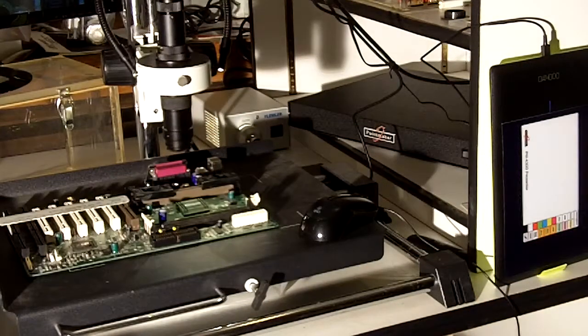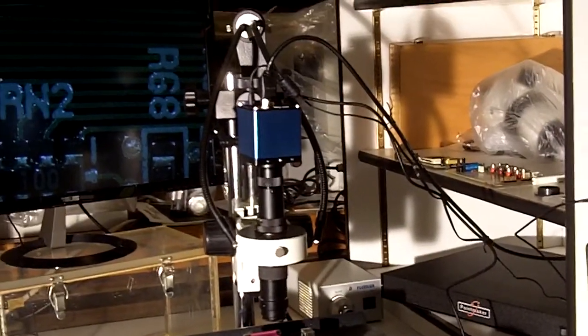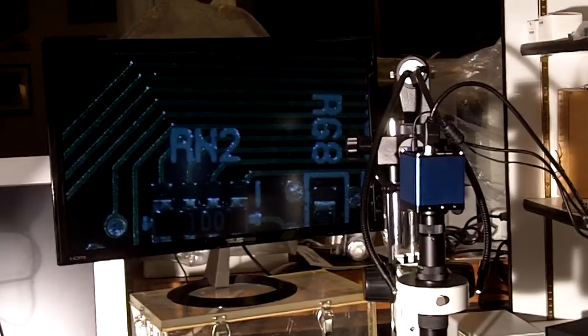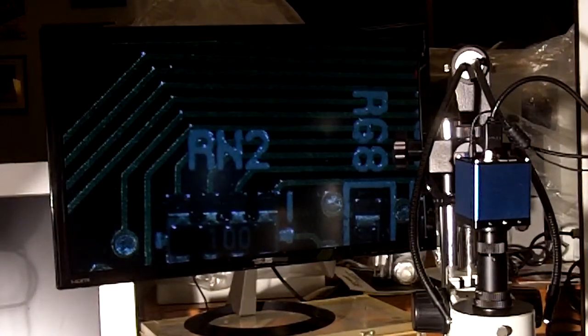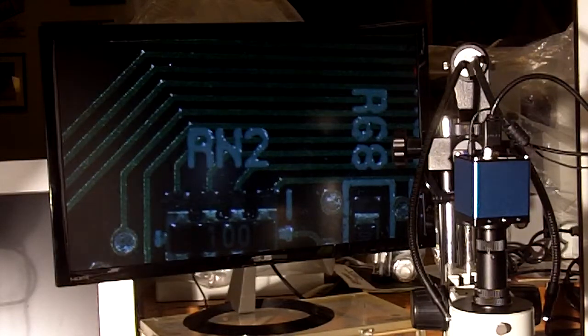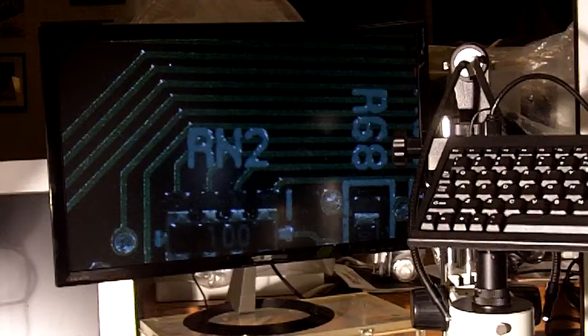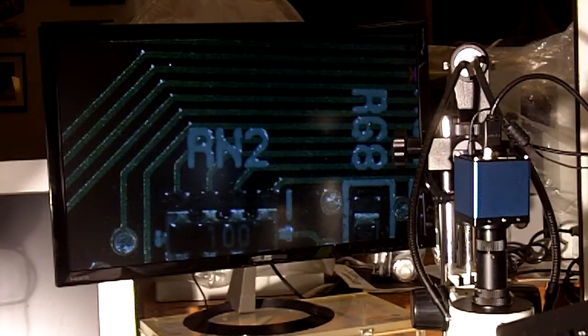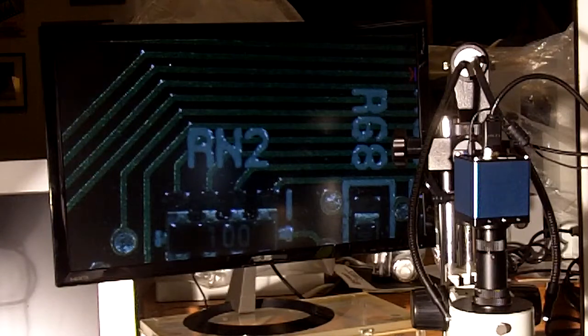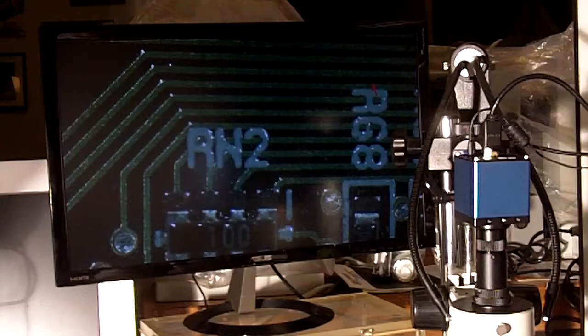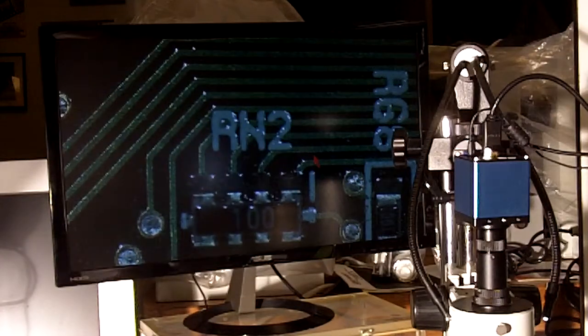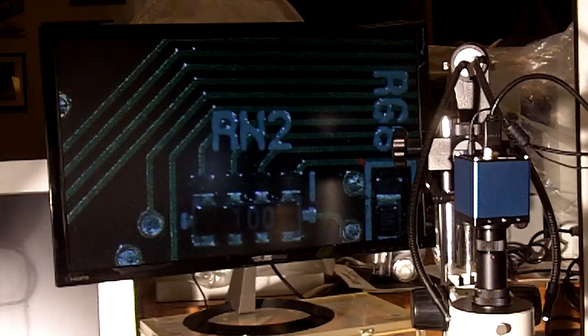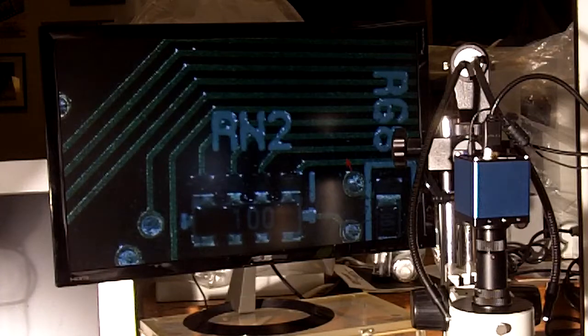And with such a system now in place, let's get a good shot of the displayer. We can now plug into the black box a keyboard that allows us to go in and type text as we see fit, or we can actually go in and move an arrow in position using a standard two button mouse that plugs into the back of the system.